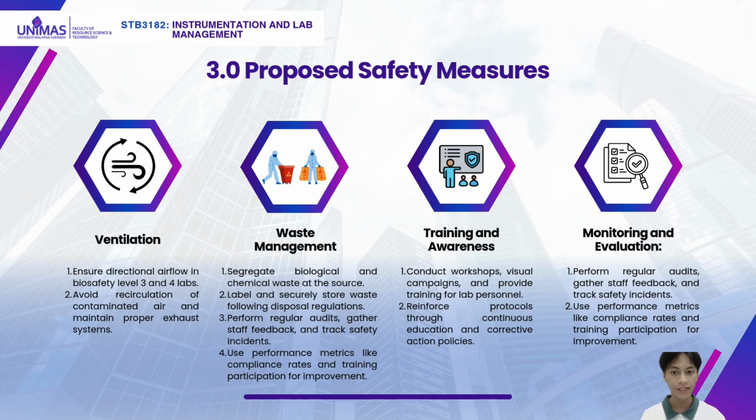In conclusion, ladies and gentlemen, the proposed safety measures, from robust SOPs and PPE requirements to comprehensive training and waste management practices, aim to create a secure and efficient laboratory environment. These measures ensure compliance with regulations, protect laboratory personnel, and uphold the integrity of scientific work.